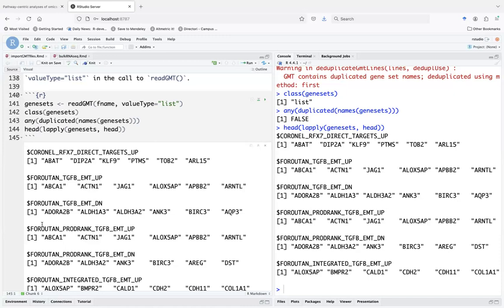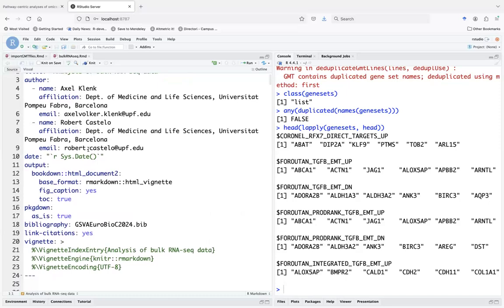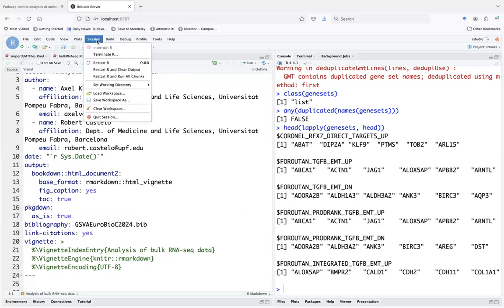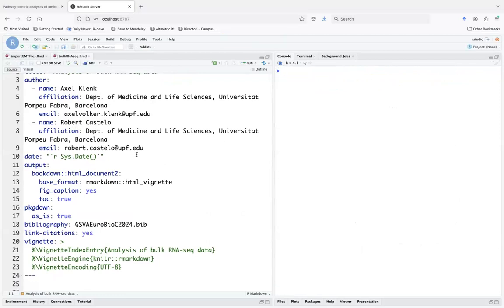I want to restart the R session to start from the beginning. You just go to this one, right? But the R session is completely spoiled. So in Session there must be Restart R. Okay. I would have said it's Control Shift F10. But here, if you want to clear this, yes, Control L. Yeah, exactly. So, perfect.